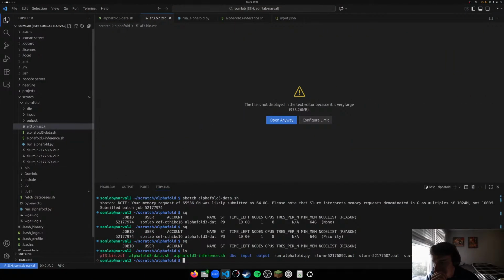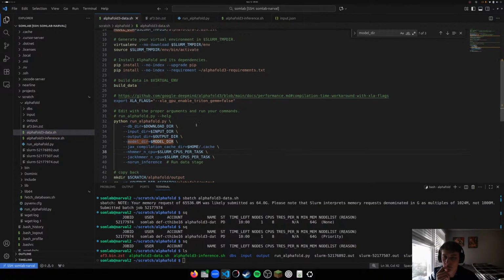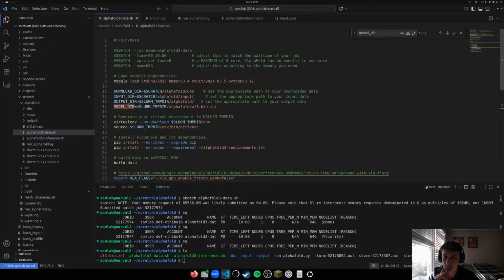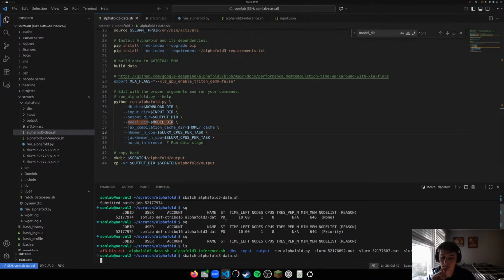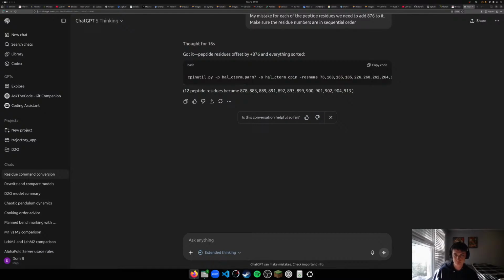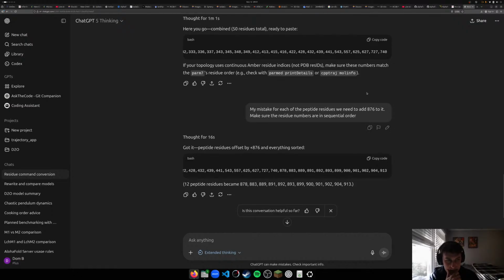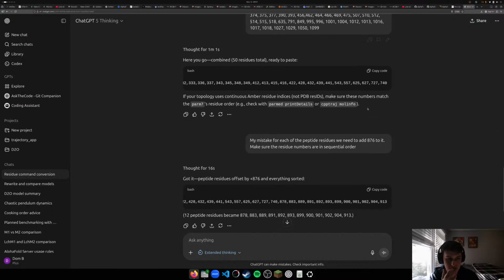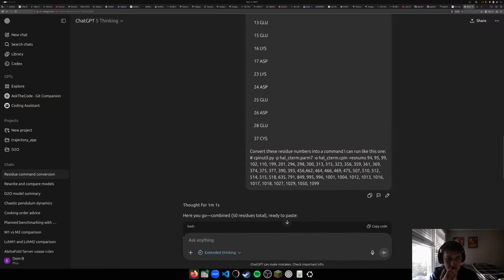All right, so it's uploaded. So now I think we can run data, I want to say. Let's see if that works. I know ChatGPT kind of sucks at math sometimes, so I might have to double check that. 876, just do an easy one.